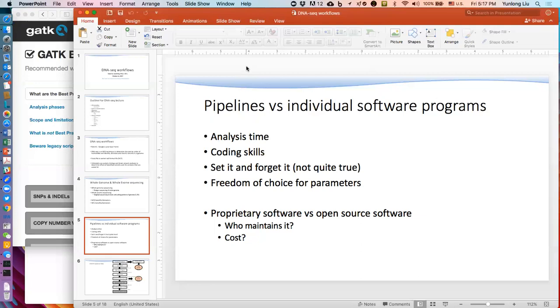It is not the kind of thing where you can just start a pipeline and walk away. What if you get into your pipeline and 3 days into it, it's stopped? That's a problem, right? Some of those you can start right after where it left off, but sometimes you have to go back and figure out why a bug happened or what went wrong software-wise, what output didn't become an input. And so be very careful if you're using pipelines. Make sure you really understand the software that's linked together because the dependencies are essential.